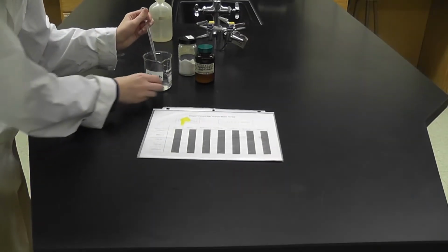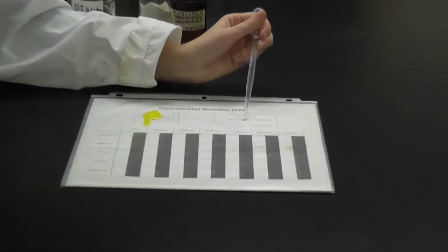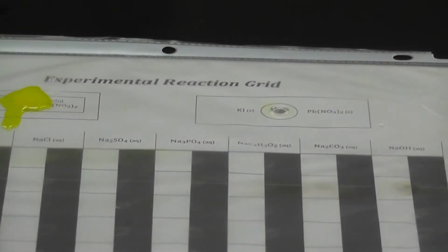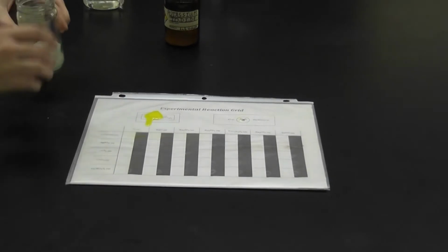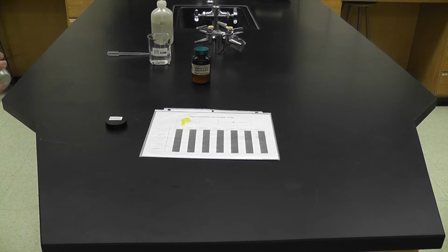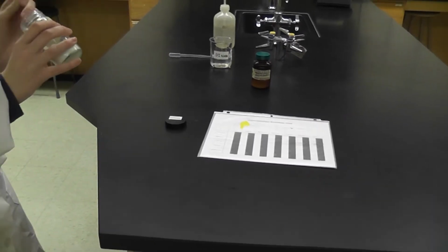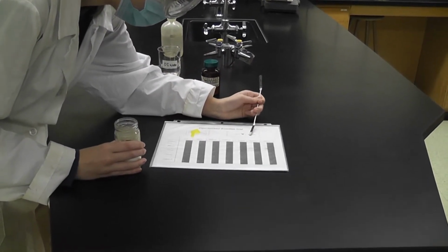Next, we're going to take some DI water and use this second table, where we start with a few drops of water in the center, right here. And then we're going to place some of the crystals of the lead-2 nitrate and the potassium iodide on the sides, but not touching the water yet. So add a few crystals. So, remember, not in it, but next to it.